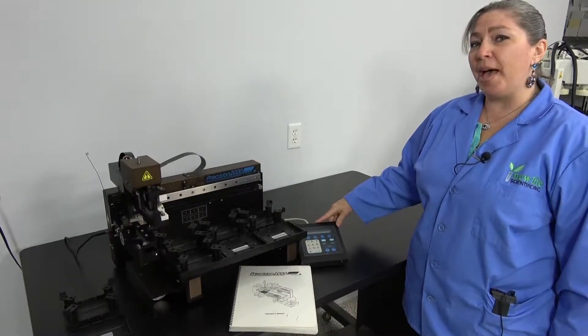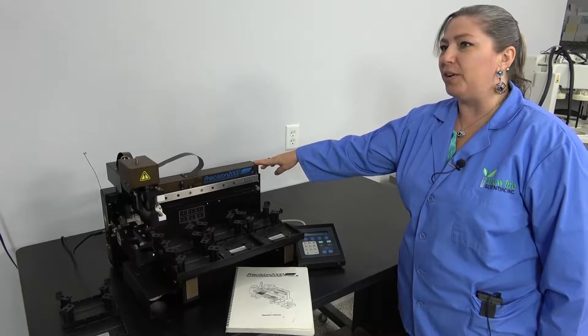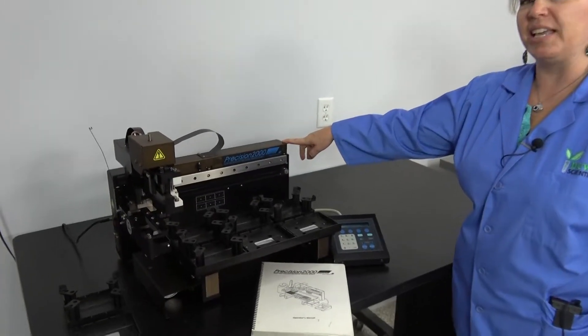Hi, I'm Lori, and I'm at New Life Scientific. We're going to take a look at the Precision 2000 Microplate Liquid Handler manufactured by Biotech Instruments.